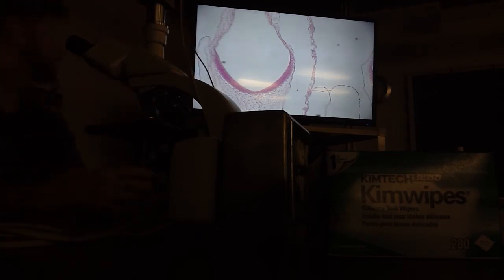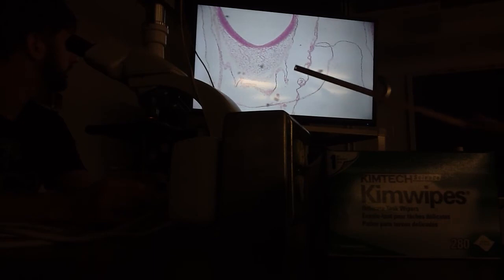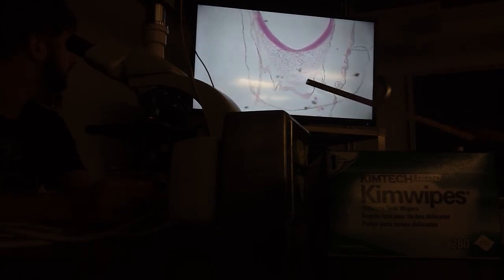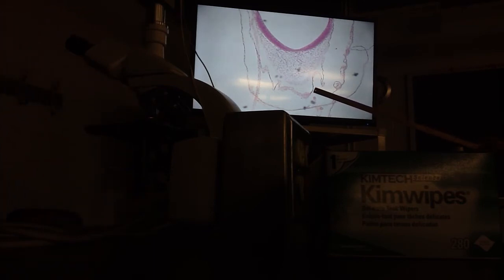Now the problem is, as we get closer to the embryo, there's another layer here. You see it's kind of folded out right there, and then you get to the ectoderm of the actual embryo's head. So which layer is this? Ectoderm of chicken embryo can touch this layer. Amnion. There you go. Amnion, thank you very much.